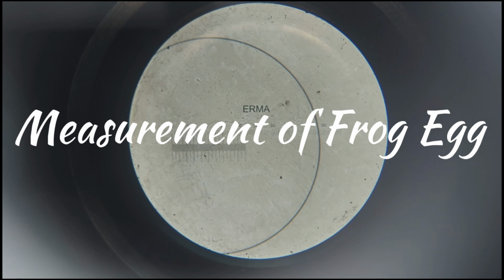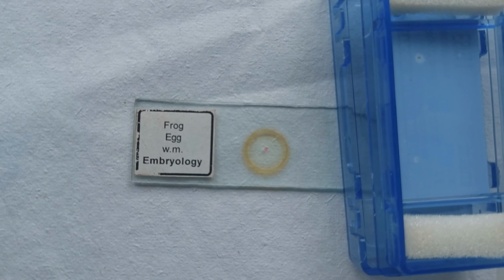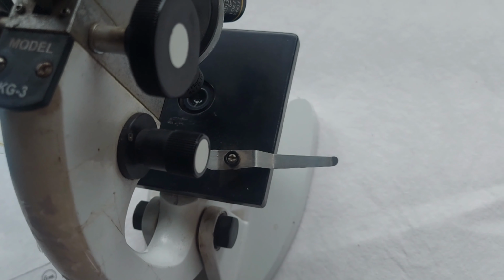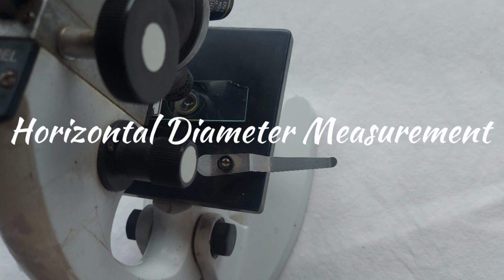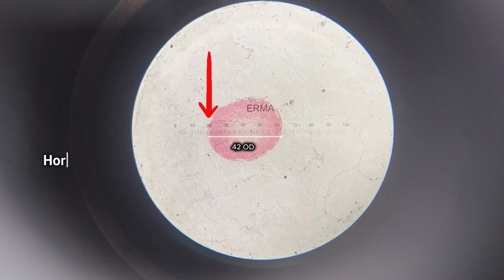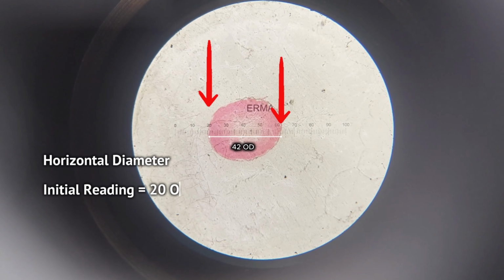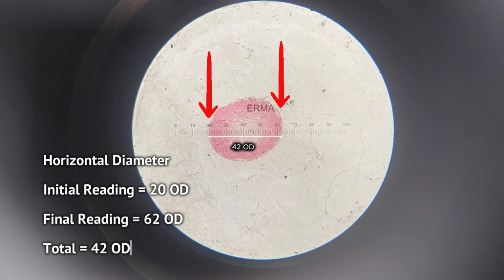After calibration, the stage micrometer slide is removed and replaced with the whole mount of frog egg slide. The specimen is brought into clear focus under the microscope. The horizontal diameter of the frog egg extends from 20 to 62 ocular divisions. Therefore, the total number of ocular divisions occupied by the horizontal diameter is 42.